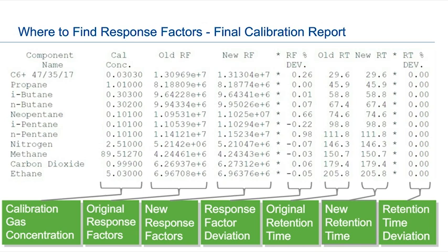So the question is, is the order of response factors correct? The concentration of the standard gas has to decrease in the heavier components. That one I'm going to come back to and answer later.